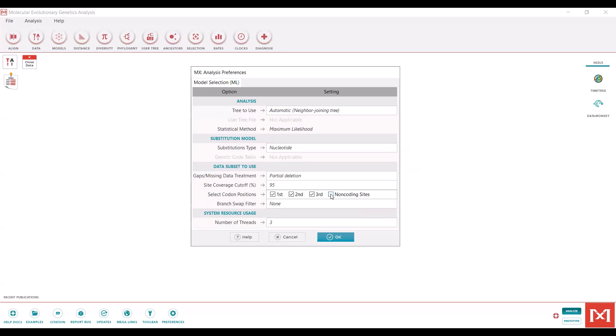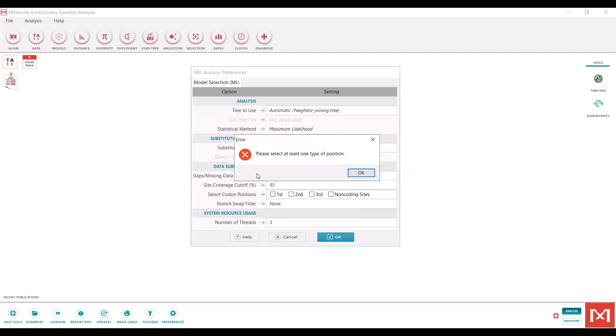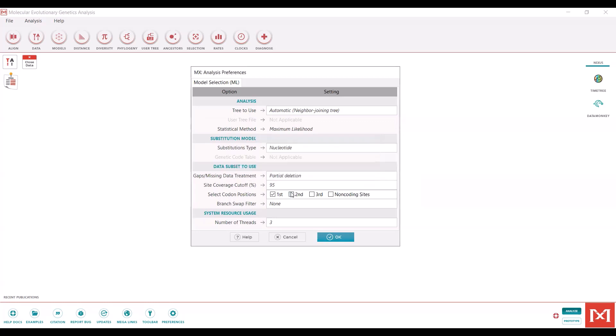Then you can also, at this stage, select which codon positions you'd like to incorporate. It's not letting me do this because I just deselected all these. When you deselect this, it takes it out of the analysis. It will select a model not including those base positions. So unless I have a really good reason from the literature to exclude a codon position, I usually keep all of them in. And then you can hit OK.